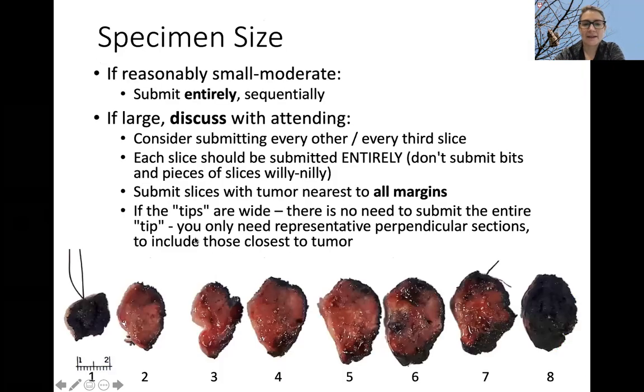And that helps us if we need to go back, if the size of the tumor was a little bit difficult to determine on gross. We go back like you guys do with breast lumpectomies, where you divide and multiply across the number of slices to determine the tumor size. So this is why the numbers are helpful, and the submission with numbers is very critical.